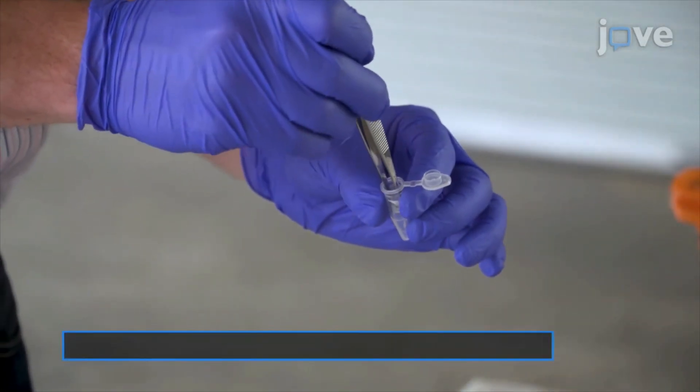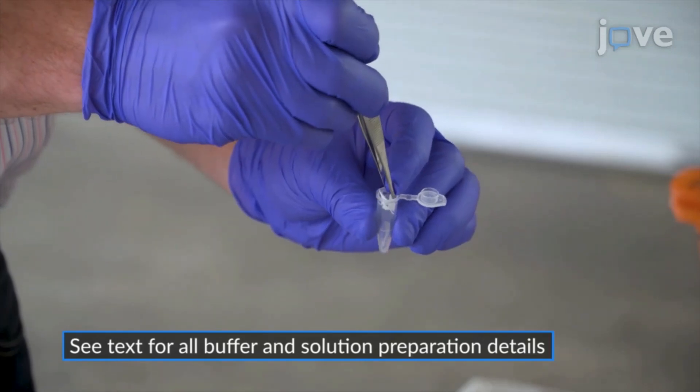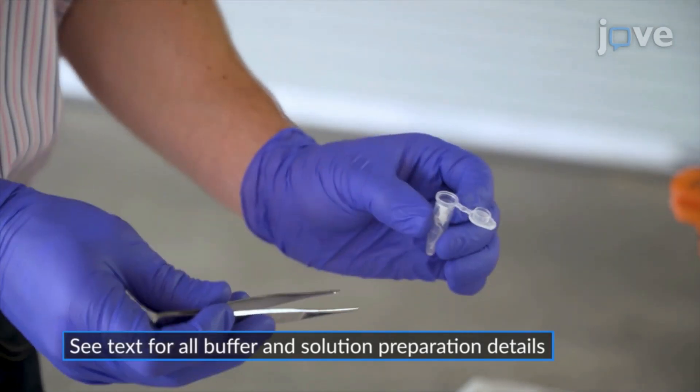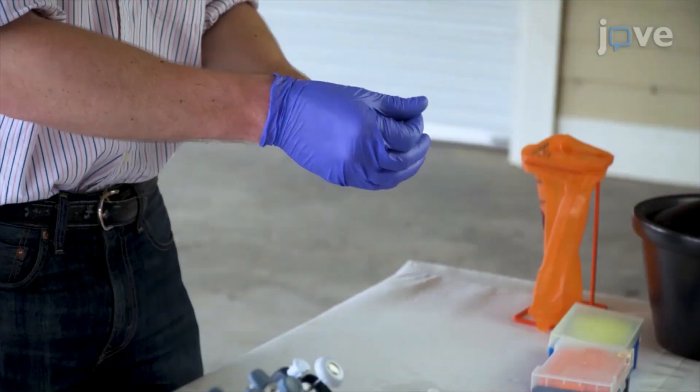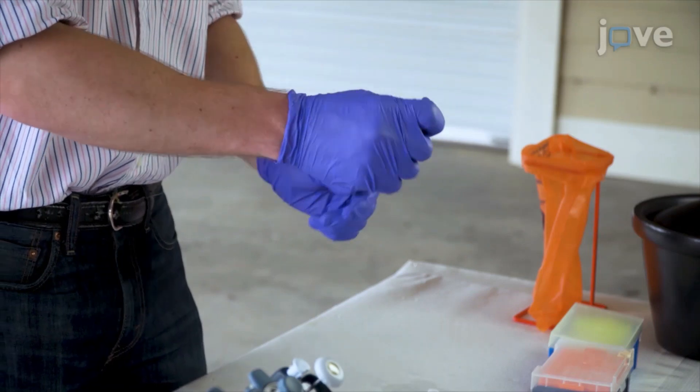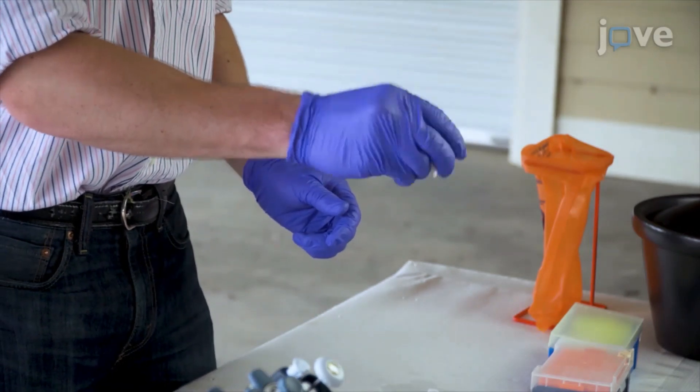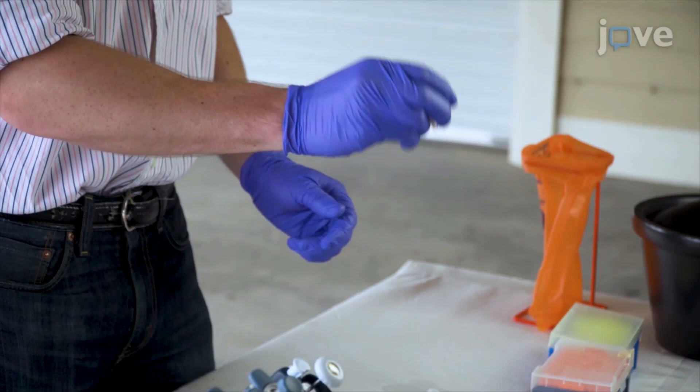Submerge 8 to 12 pieces of paper in 400 microliters of extraction buffer in a 1.5 milliliter tube for a 5-minute incubation at room temperature. Vortex or otherwise agitate the paper for 10 seconds once every minute.